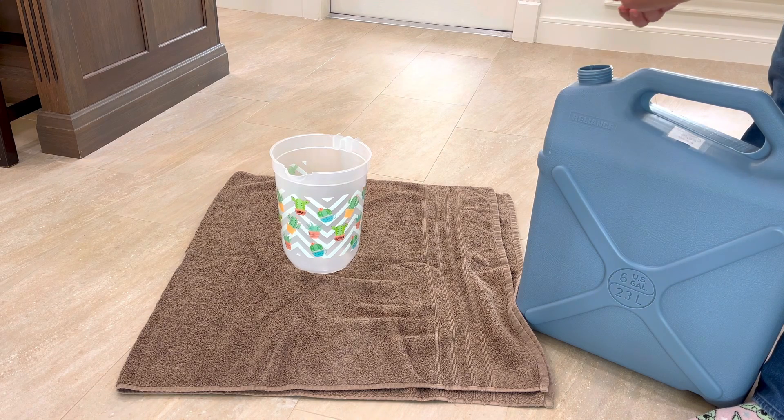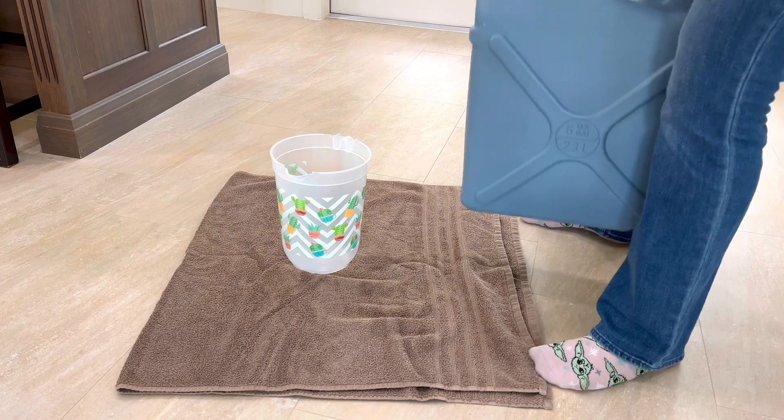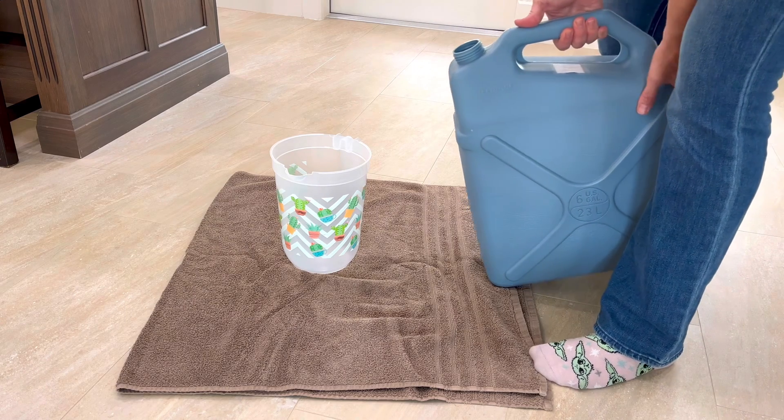For now, I'm going to be pouring some of this water into that pitcher and we're going to test it first, just to make sure there's no bacteria growth and that the water is safe for drinking, cooking, washing, whatever.